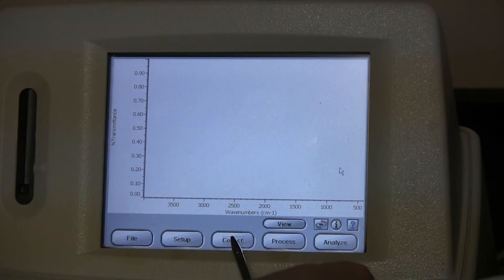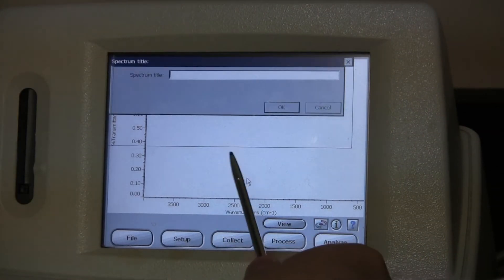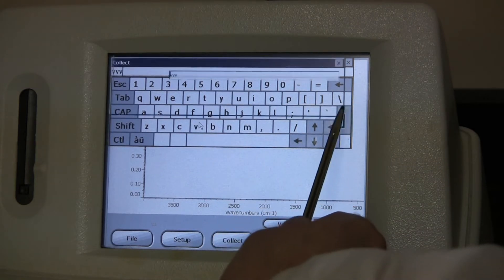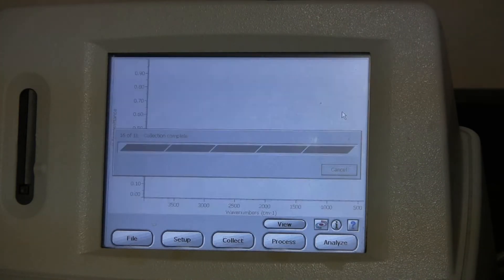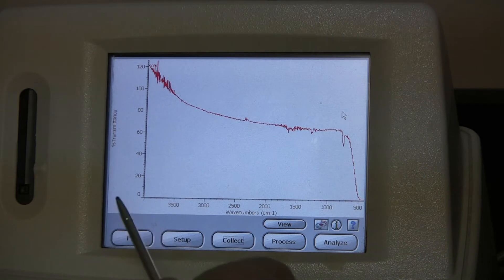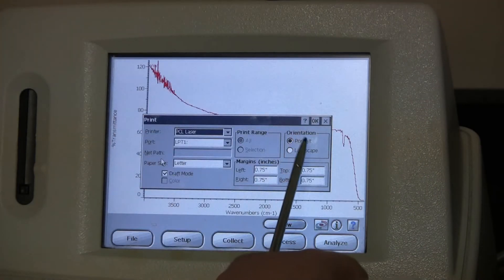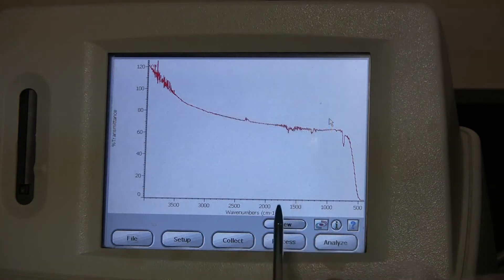Start off by going to Collect, and then Sample. Type in a name once again and hit OK. Wait for the scans to finish. Once they're finished, you can print off a copy of this by going to File, Print, changing it to landscape, and hitting OK.